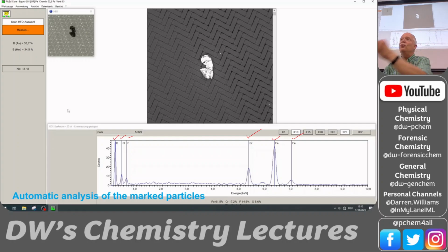So if that's in your fuel line, you're probably failing the test because you don't want that particle to get into your fuel injectors. Okay, but you've machined these parts, so there's particles of steel everywhere, and so trying to clean those off, you clean them, then you do this test to see if they've been cleaned well.